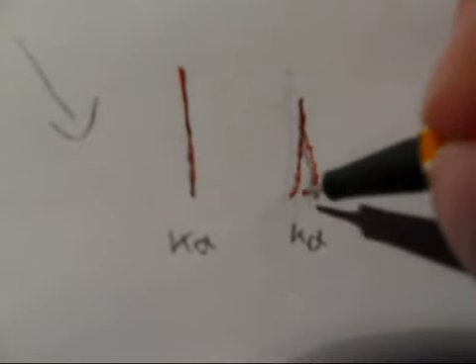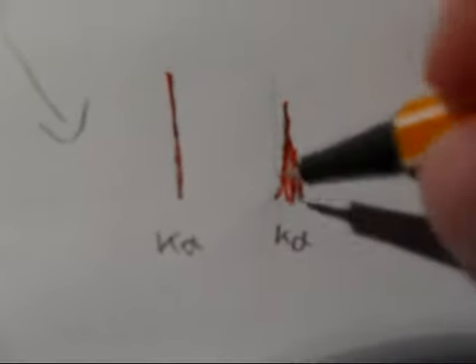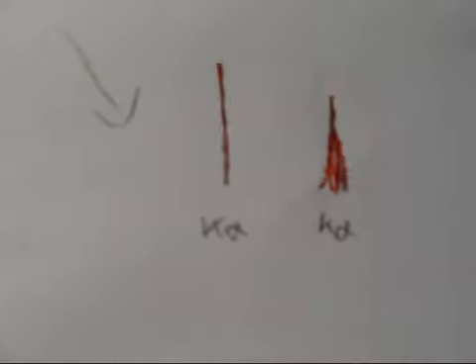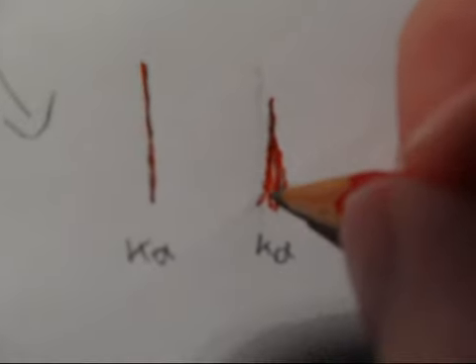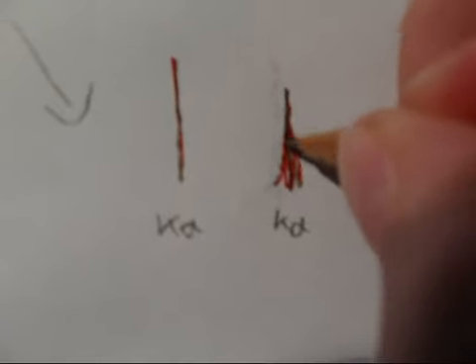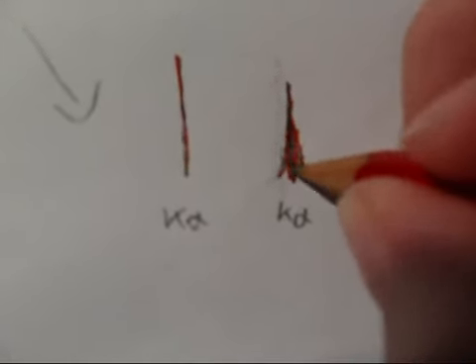So it will look like this. As you can see, I can't draw, that's why I did all that stuff in advance. So I try to do it like this. You'll have the typical K alpha peak as expected. Well, you'll have a bit around it as well.